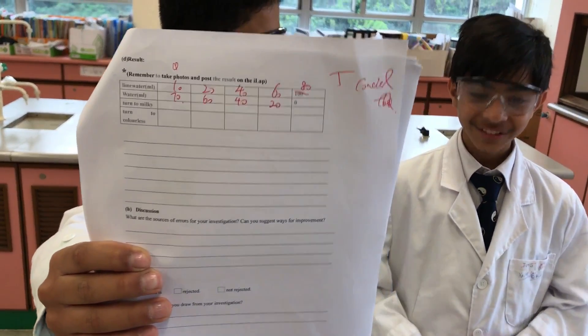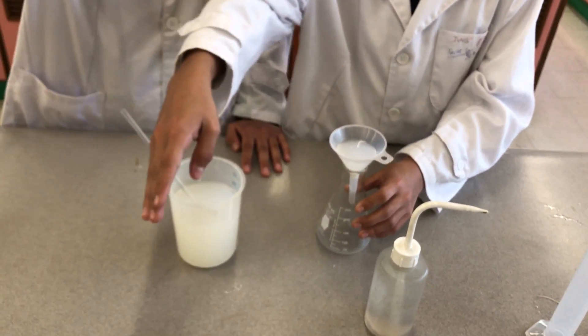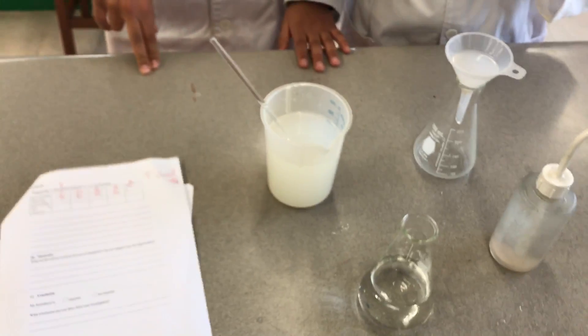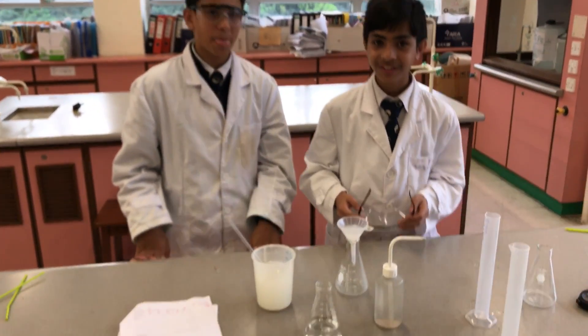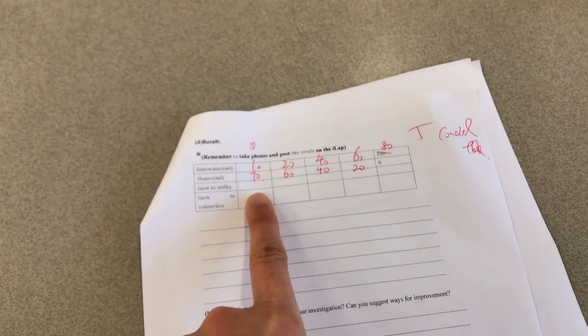So this is what we're going to be doing — this is our formula. Because of the time limitation, we already prepared the limewater. We are doing the first formulation: 10ml of limewater and 70ml of water. We are making limewater — we didn't make the limewater yet. Okay, we are doing the first one: 10ml of limewater and 70ml of water.